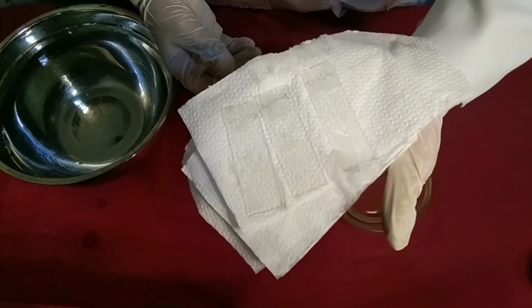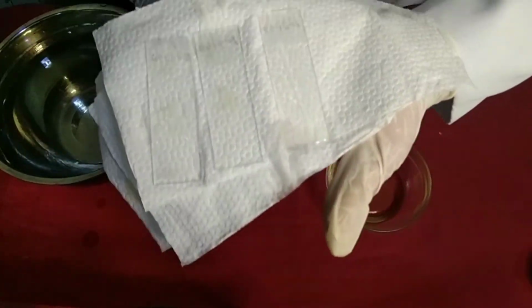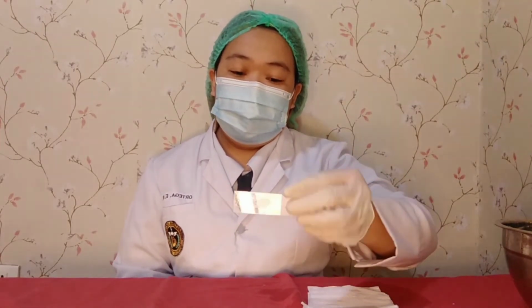So this is now the tissue section on a glass slide. The completely dried tissue section slide is now ready to be placed in an oven and all set for the next procedure, which is staining.